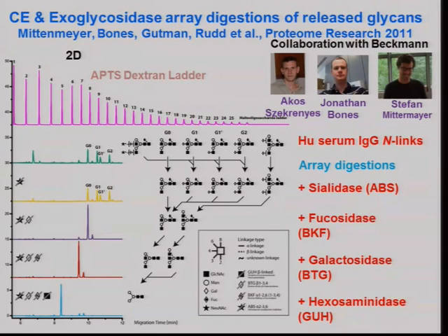But actually, if you're doing IgG, they're very robust, and because you've got several checks, you can do mass spectrometry. You also know the pathway that produces these glycans, so you can argue from other places. But the enzymes are just such an important tool. A lot of people, especially people who use a lot of mass spec, are very physical-minded people. They didn't really like it because it's kind of wet bench and a bit messy, but one after another, the mass spectrometrists are now realizing how powerful this is.